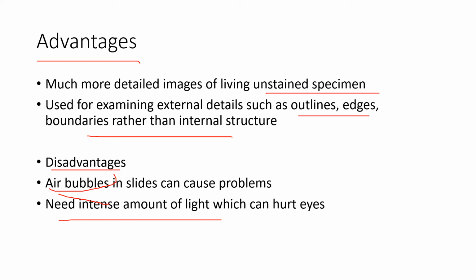See, we are making sure that whatever light is passing through the slide does not pass through the background, and passes only through the cells. So already we are stopping a high amount of light. We have seen in the previous slides how the field was stopping. We have seen that whenever the light was passing through like this, we were stopping these kinds of light and allowing only these lights to pass through.